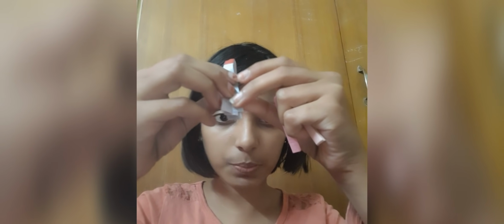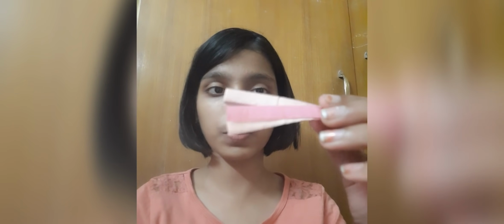For example, if we have any acidic substance like lemon juice, or any substance which is acidic in nature, we can use blue litmus paper. Blue litmus paper will change into red litmus paper for an acidic substance, and for a basic substance we use red litmus paper. When we add a drop of basic substance on red litmus paper, it will change into blue litmus paper. It doesn't matter whether the substance is a very strong acid or a very strong base; it should be acidic, basic or neutral in nature.